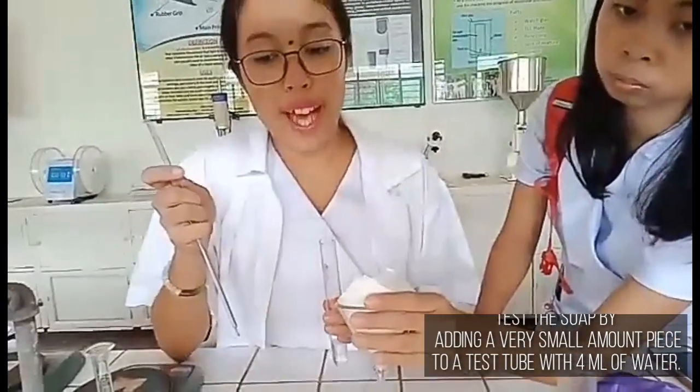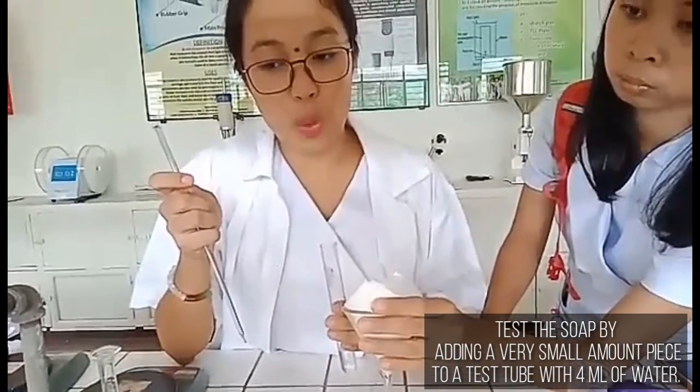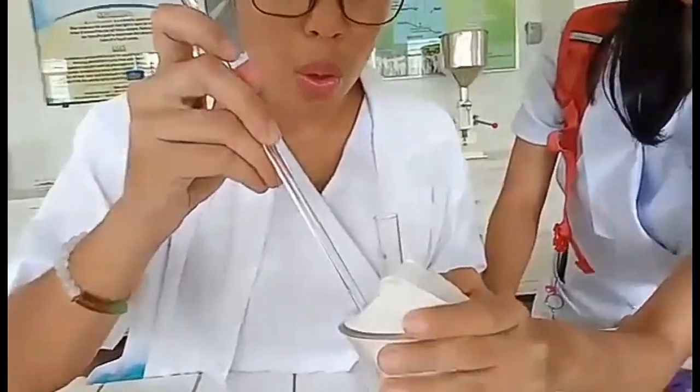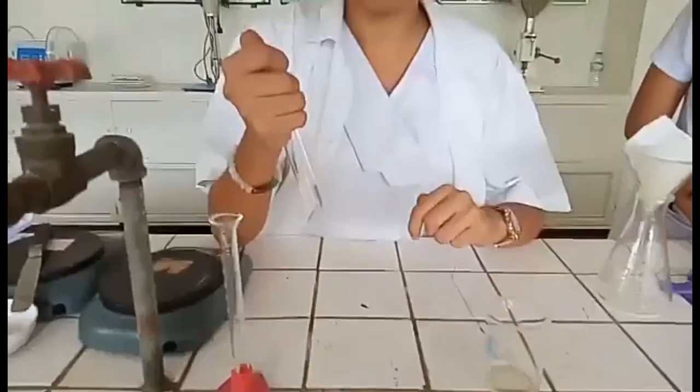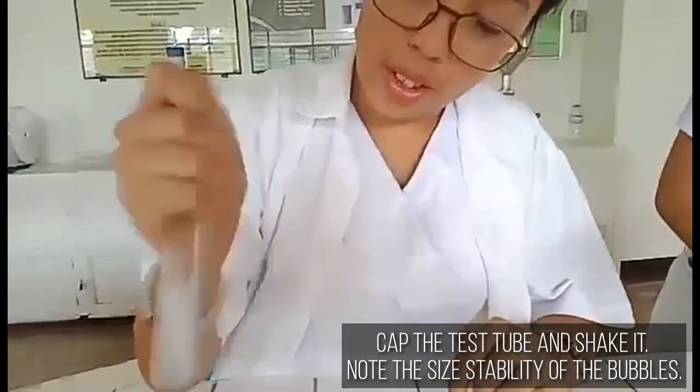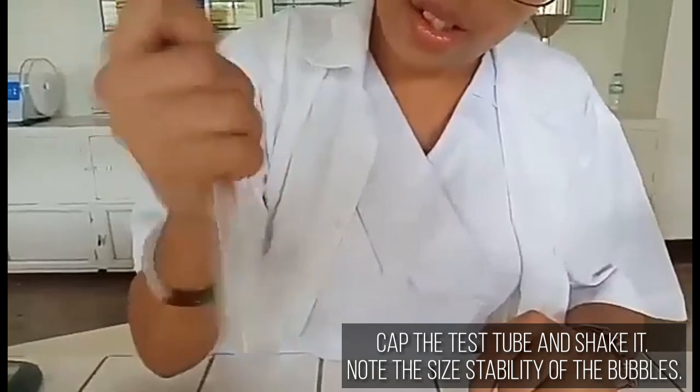Test the soap by adding a very small piece to a test tube with 4 ml of water. So this is the 4 ml of water. So we're going to get some piece of soap. Cap the tube and shake it. So as you can see, there's a stability of the bubbles.